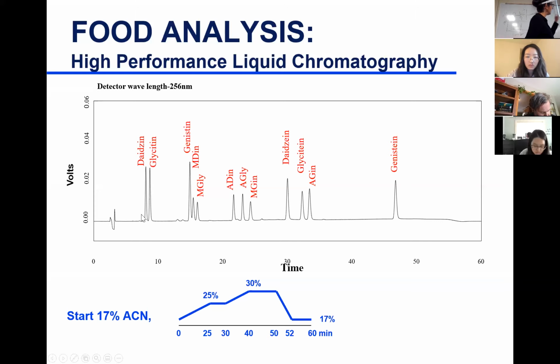They're going to come closer, maybe even in my void volume. We will not separate them from the solvent front. These three will come out as one, these three as one, these three as one. So the analysis time will be shorter, but I lose separation.